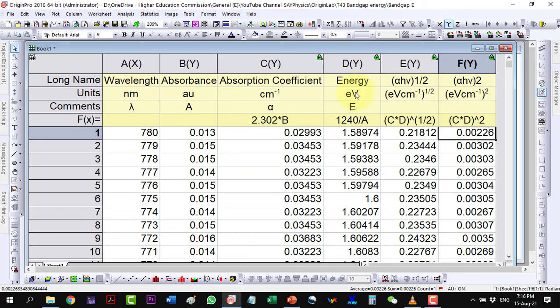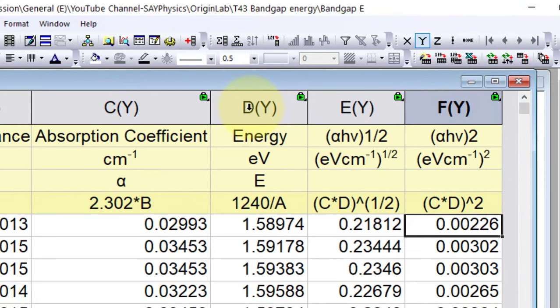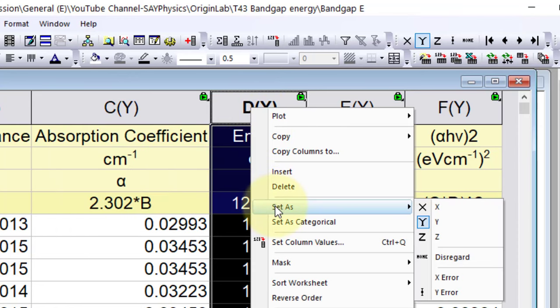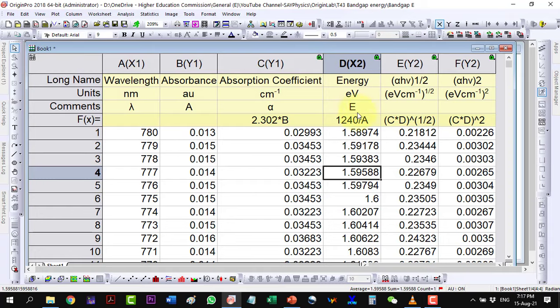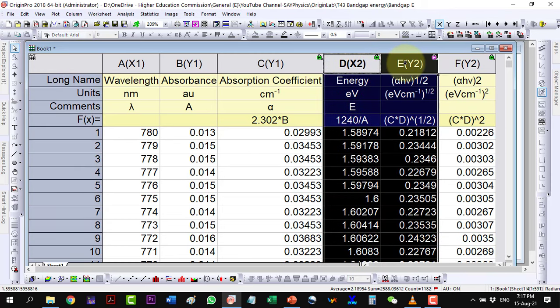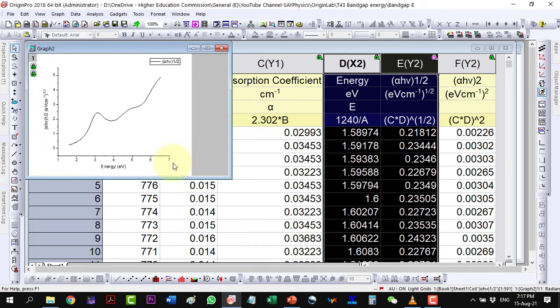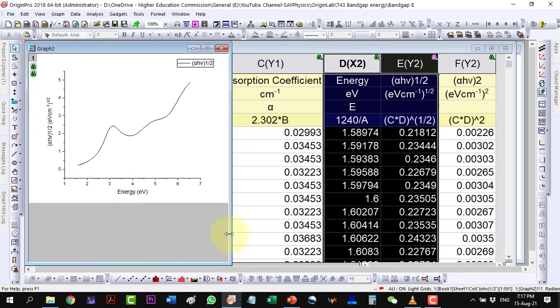Let us set the energy column as the X column. Plot first these two columns and then the next column to check which of them is giving the best fit for the extrapolation to the X axis.